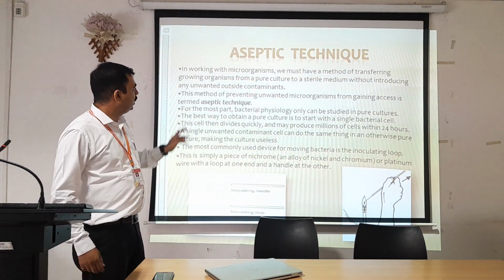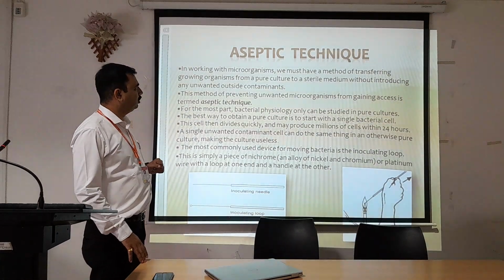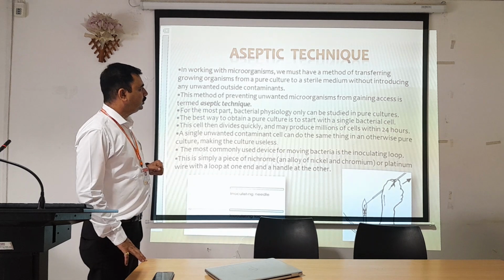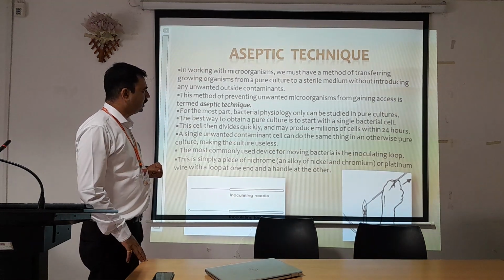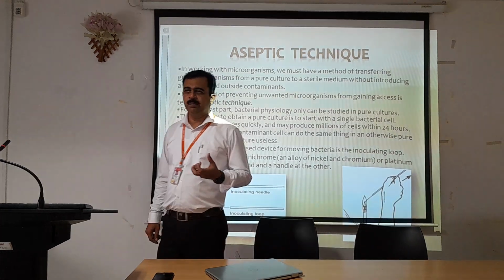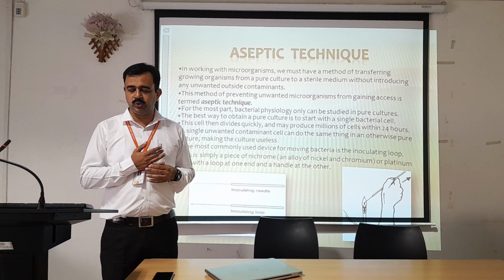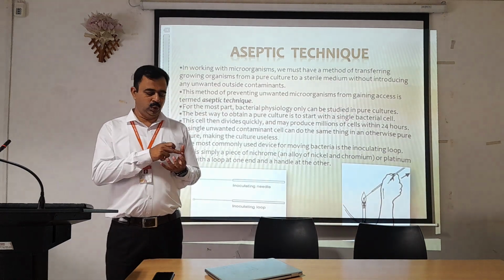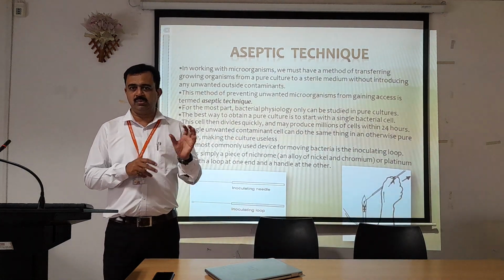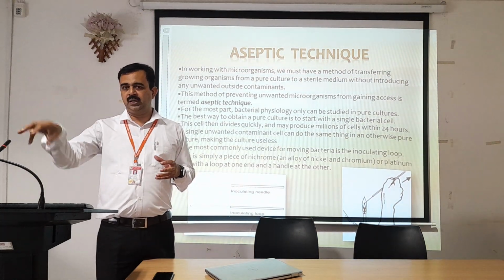Aseptic technique. In working with microorganisms, we need a method of transferring a growing organism from a pure culture to a sterile medium without introducing any unwanted outside contaminants. For example, if we have a pure culture and want to transfer it to another medium, we know that no other organisms are present inside this plate, and now we need to transfer it.